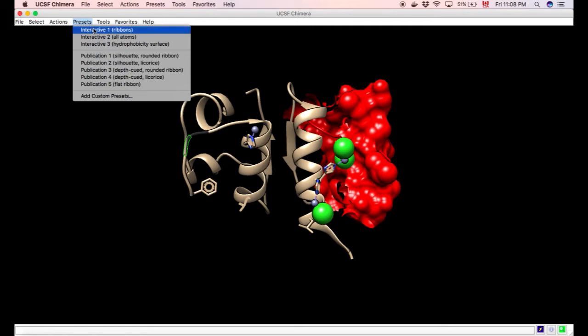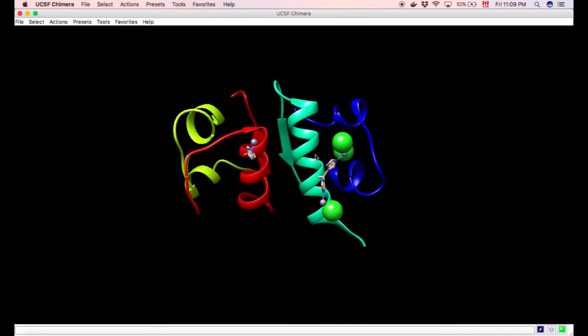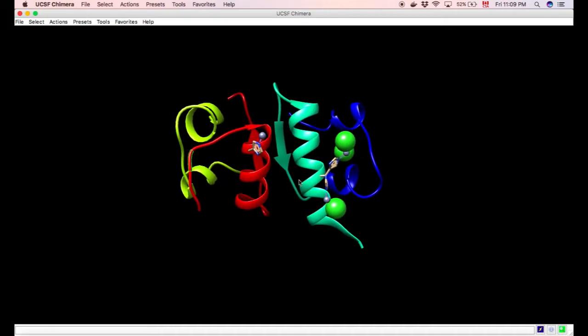So tonight we'll go over this. It's the presets. Presets can actually be changed in the code or through here to add custom presets. They're very simple, and can offer you a wide range of representations soon after hopping on Chimera and looking at a new protein, to either analyze or simply to make your final picture. So through ribbons, it does two things: simply ribbons, and also adds a nice rainbow coloring, which is very nice.